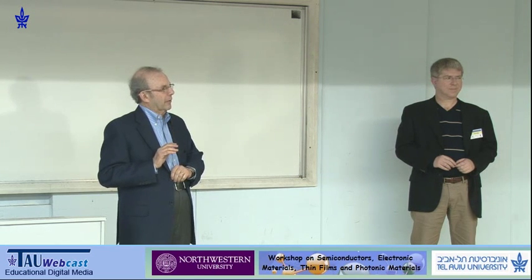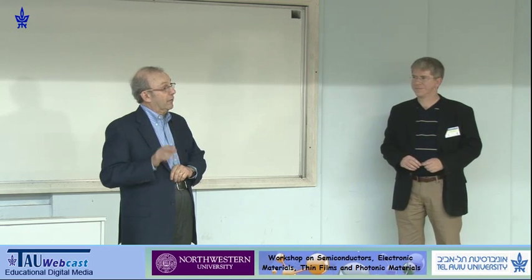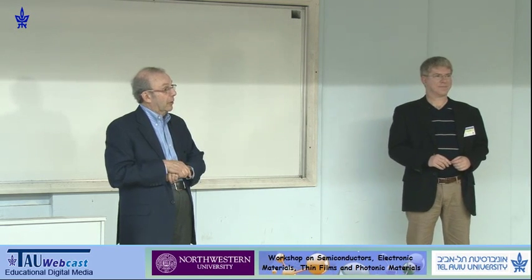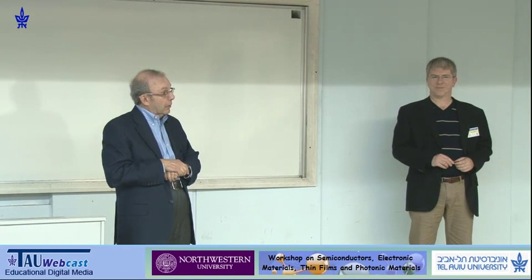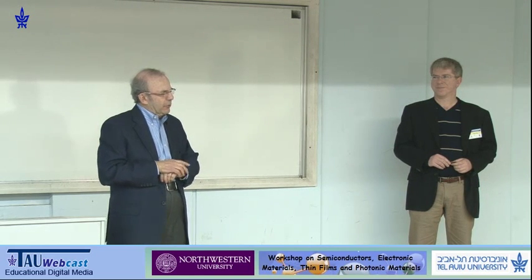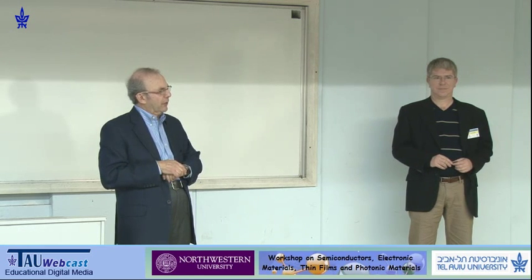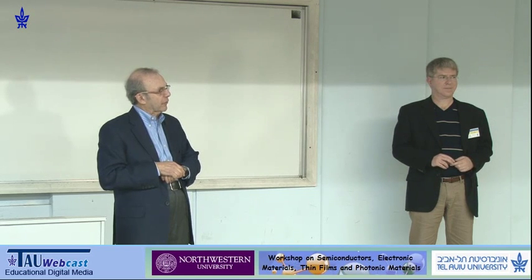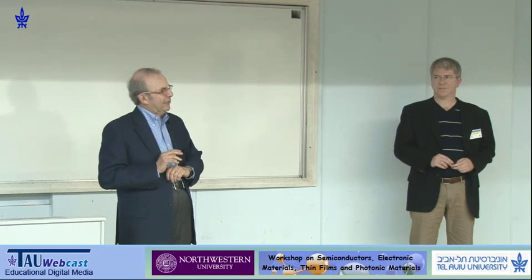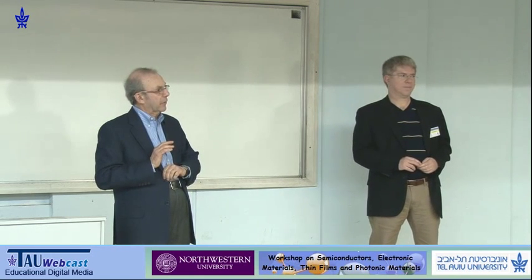My question was more methodical, on the method. You want to know whether they're amorphous or crystalline? I want to know whether, with this instrument, you have the capability to get crystallographic information. It's the wrong technique to get crystallographic information. Either you want to use X-rays or you want to use selected area diffraction in an electron microscope. Its strength is getting the chemistry, and that's why you have to use it in correlation with other techniques.